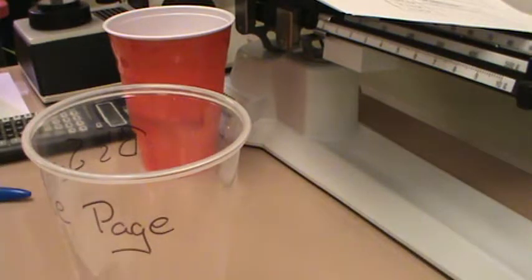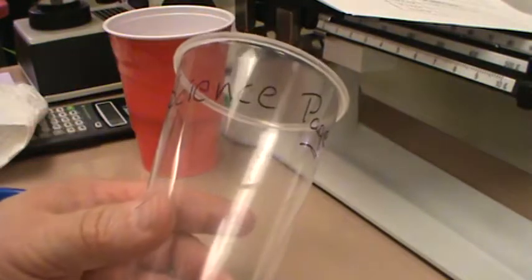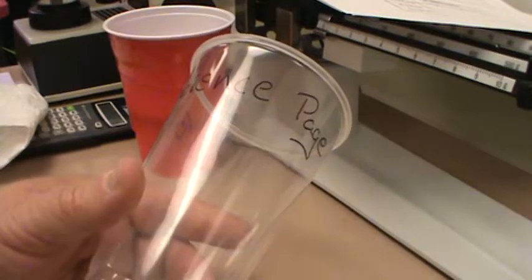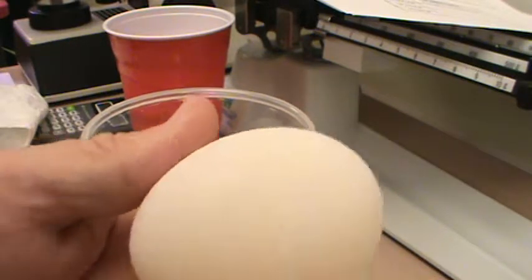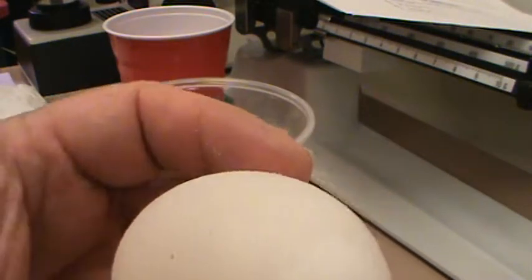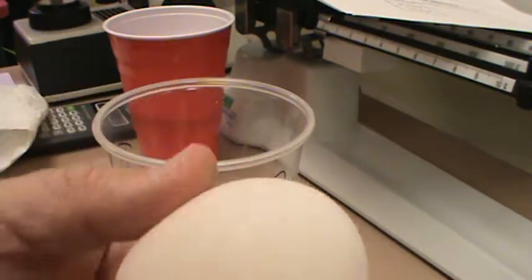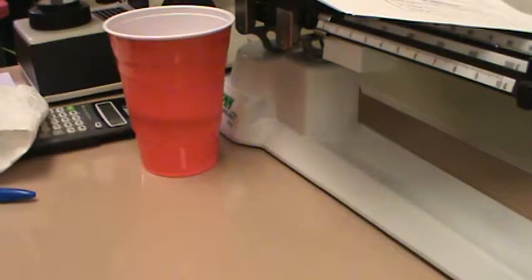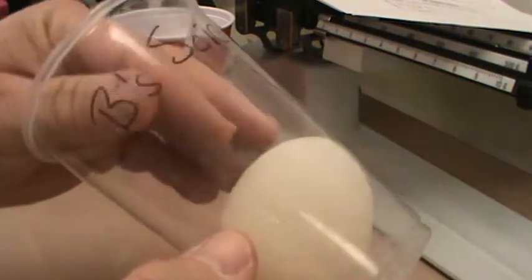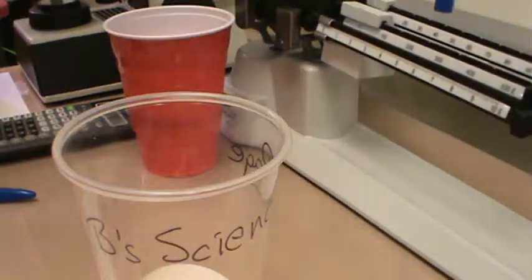All right. So we have our egg. Now we're still assuming that the plastic cup has not absorbed any kind of liquid and its mass has not changed as a result of the experiment, and that any change is happening solely in the egg. And we still have this outer layer. This is what was left of the shell. It appears to be a kind of an even color. I'm going to put it back in the cup, and we're now going to remass this.